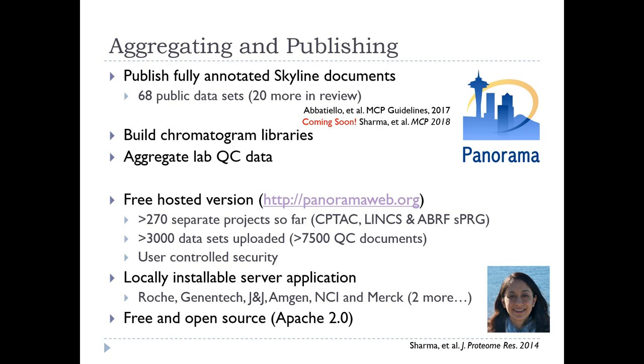So this is a hosted version that we host. But if you're part of a group like these pharma companies where you want a private server inside your firewall, then that's also possible. But otherwise, all of the code is free and open source under Apache 2.0 license, like Skyline.